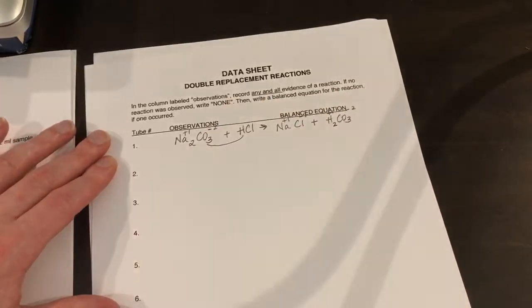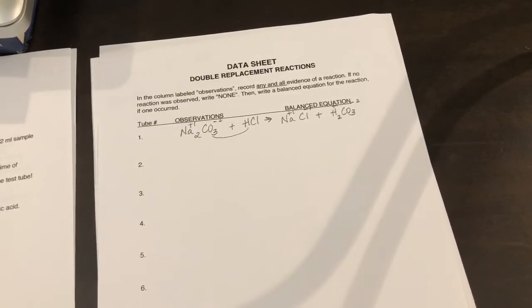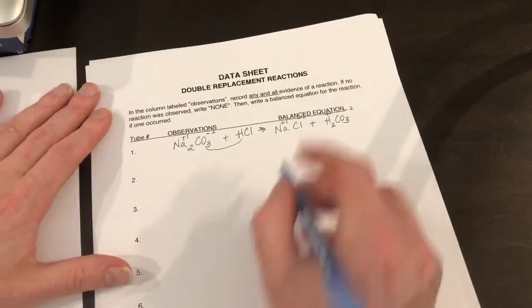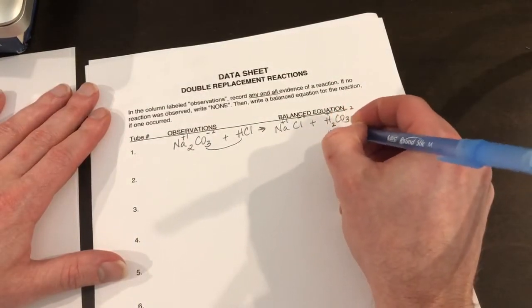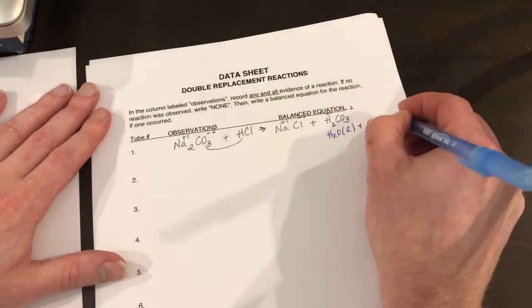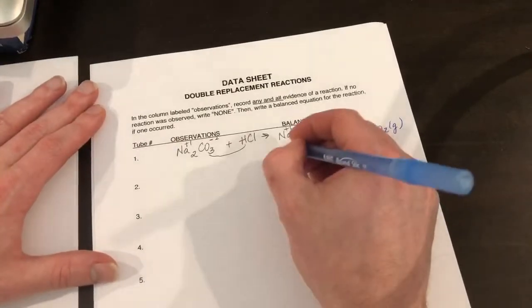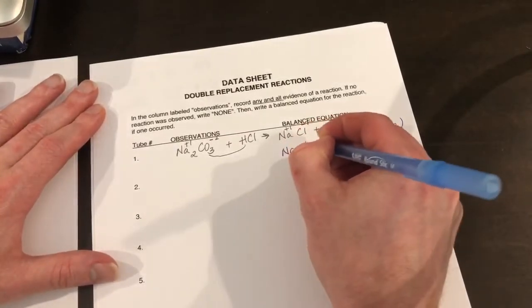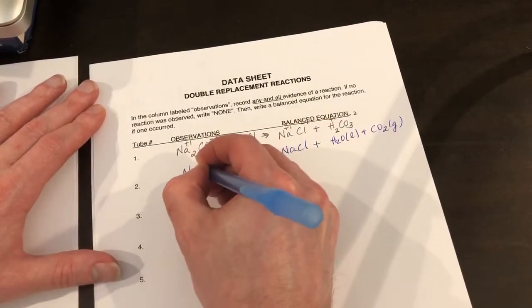Now, watch this. Carbonic acid is H2CO3. So whenever you break that down, it always becomes liquid water and carbon dioxide gas. Okay? And that's why you get bubbles. Okay? So our actual complete reaction looks like this.